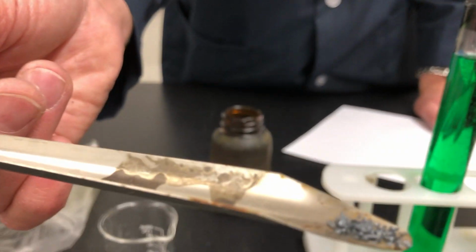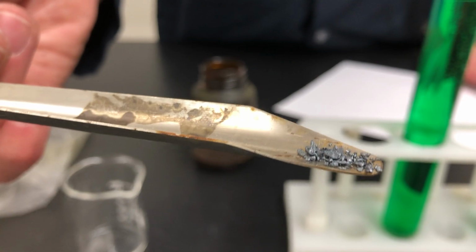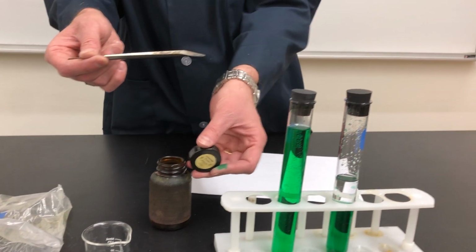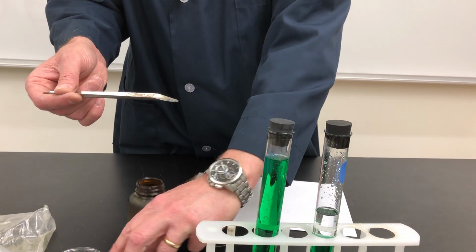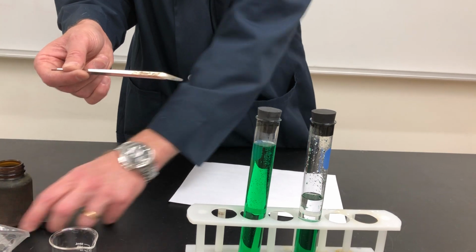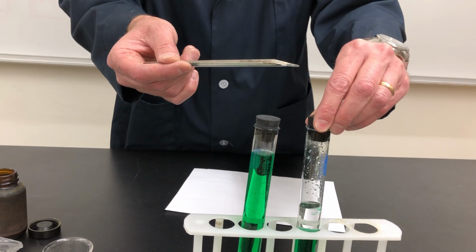So once again, elemental iodine, we used this back on the very first day of class. We did a reaction where some of that stuff got vaporized and made a purple cloud. And iodine, a solid under ordinary conditions, we'll see how it mixes with our hexane and water tube.